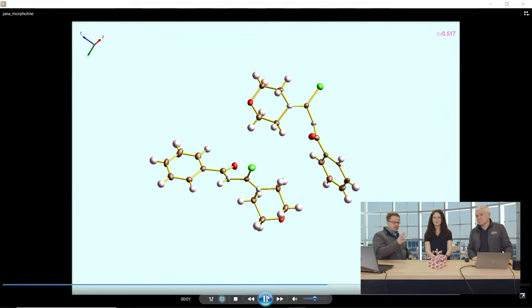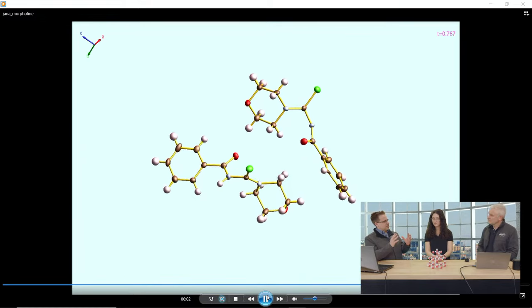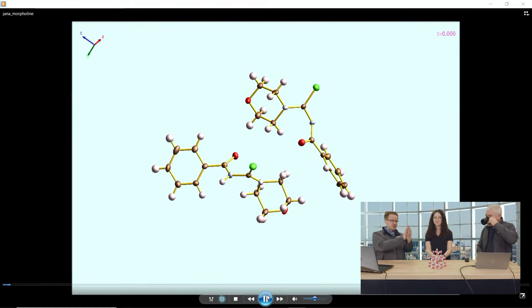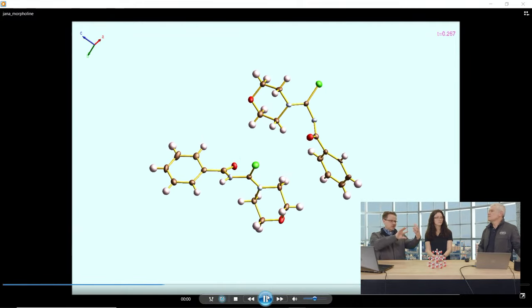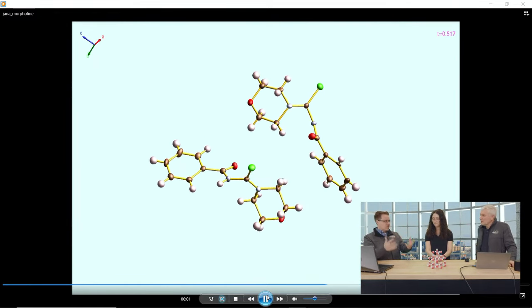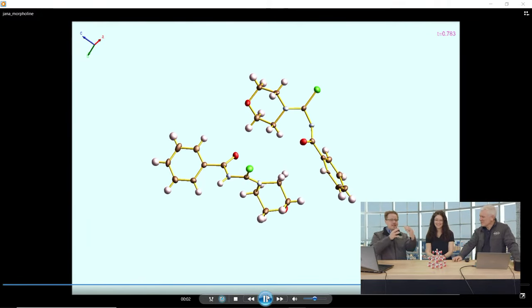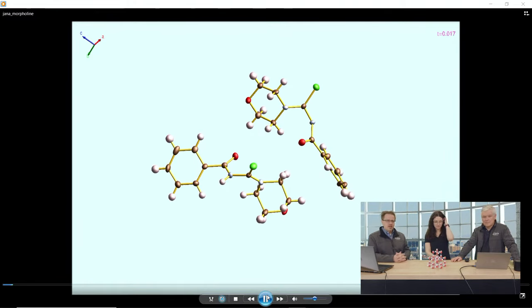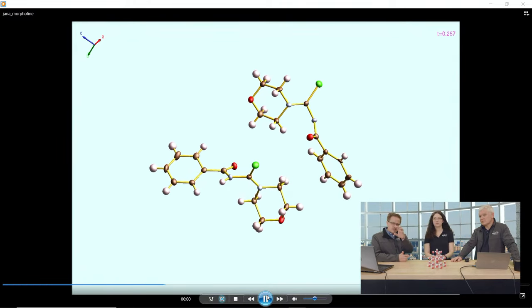All right, so my understanding is, this is kind of like the old stop motion animation, right? So what we're seeing is a total animation, but really in the unit cell, we're just moving along the modulation axis. And we're just saying one is stuck like this, one is a little turned, one is a little turned. It's not saying that it's moving in real time, but it looks cool. It just represents how that twisting motion does occur along the modulation axis. No, that's pretty cool. And again, the other thing that I see here now is that all those spots got much smaller.